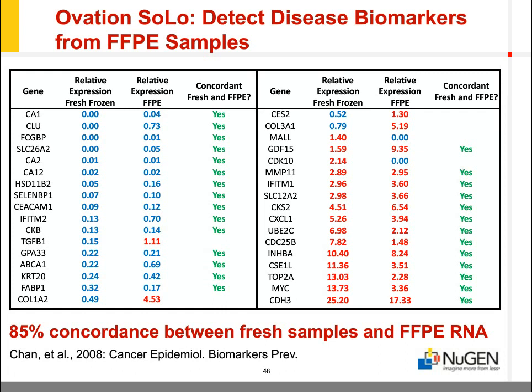Using this analysis, we observed a high concordance rate in measured gene expression differences between fresh frozen and FFPE preserved RNA, demonstrating that Solo libraries can accurately detect disease biomarkers from FFPE archived material.